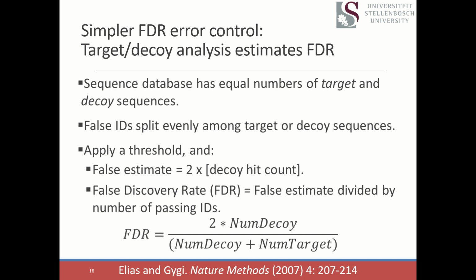So by sorting all the IDs from top to bottom, we can figure out where to set a threshold in order to compute that we've hit a false discovery rate for the whole collection above that threshold that we actually want. So maybe we say a 2% PSM false discovery rate would be acceptable. We'll move that bar downward until we've hit that 2% boundary for the whole collection.